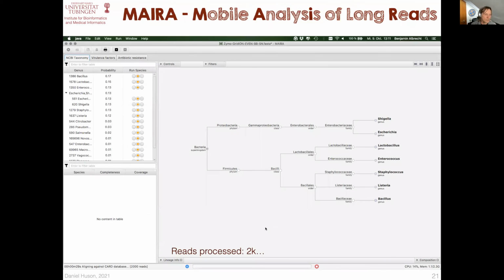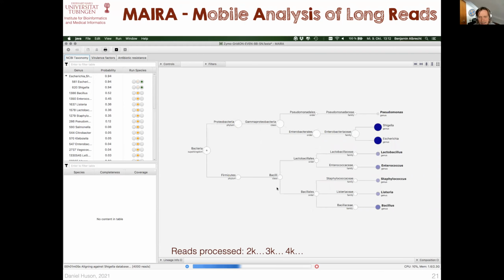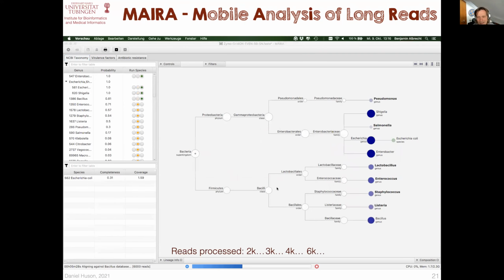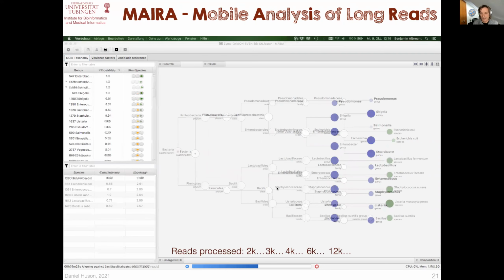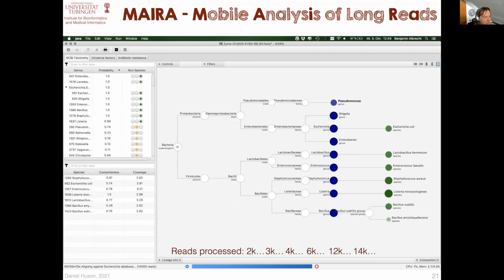So it looks something like this. You fire up your nanopore sequencer and you're running base calling on something like the MinIT or on some graphics GPU, something like that. As the sequences come out of the base calling, this program monitors the directory where they arrive, and then every now and then it updates its analysis, something like that in this animation here. And so this does an analysis based on protein alignment. Again, we use that, it seems to be our favorite idea.